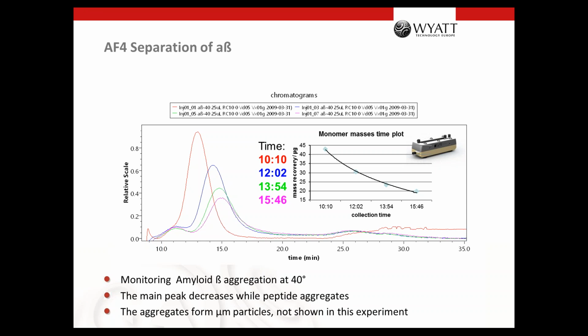So the next question is a very practical one. I have a small hyperbranched polymer which measures Mn 3,400 grams per mole. The Mw is 10,000 and has a PDI of 2.5 by using SEC with PS standards. Is it possible to measure this in FFF?